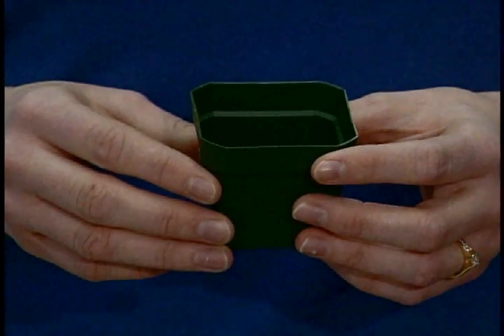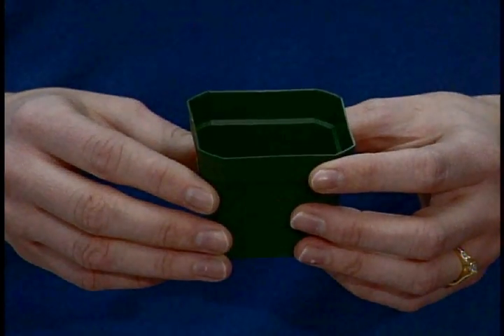Now let's start by figuring out how many Arabidopsis seeds we're going to need. I'm going to be using a two and a half inch square pot like this one. You don't want more than six plants in a pot this size or the plants will be too crowded. I'm going to plant two pots of wild type seeds.